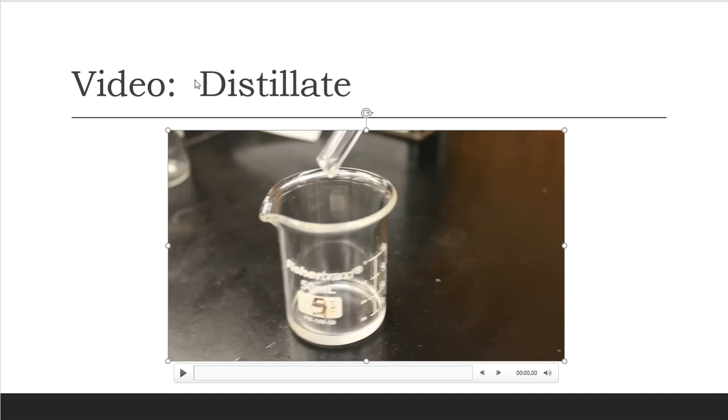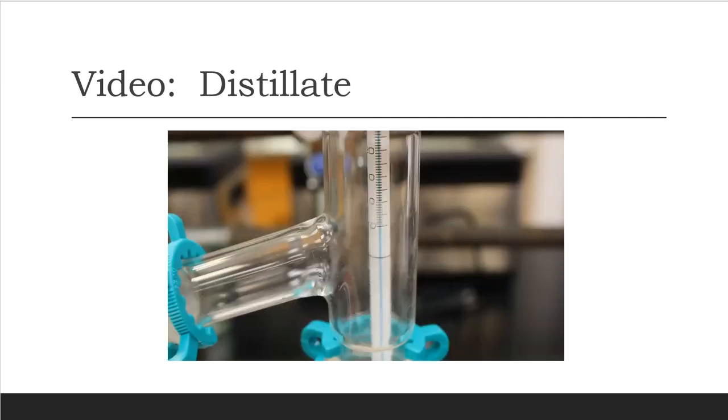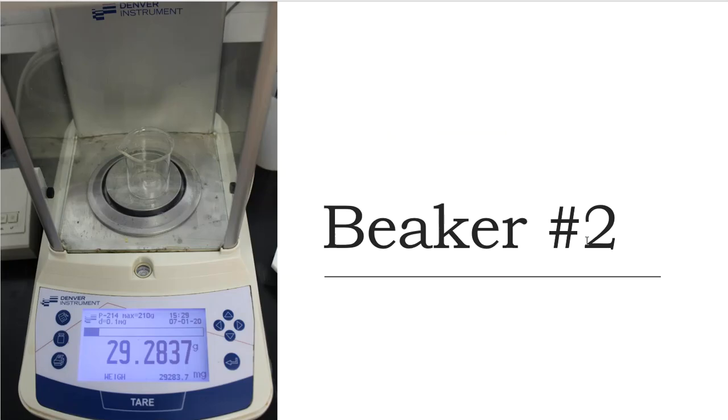So as that was distilling over, I got really worried. The reason is because this was a 50 mil beaker, and there was a lot of solvent in that boiling flask. So I was like, uh-oh, maybe I need to weigh another beaker, just in case. So here's beaker number two. And this was a tared balance that I put the beaker on, and beaker number two weighed 29.2837. So that way I had the mass of this just in case I needed it as a backup.